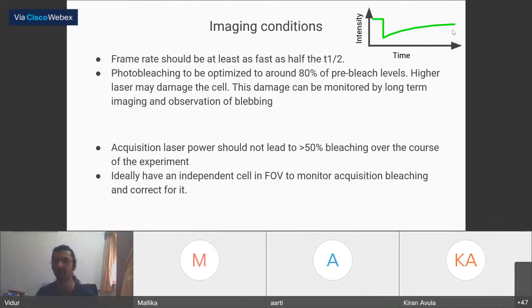You will have some loss in fluorescence over time, because one, you photobleached a region and therefore some fluorescence is lost, and second, there is acquisition bleaching in the system. So the exact intensity post bleach should not be equal to the pre-bleach value. If you're assessing some organelle or some compartmentalization, that static distribution should come back to normal, is what I meant.